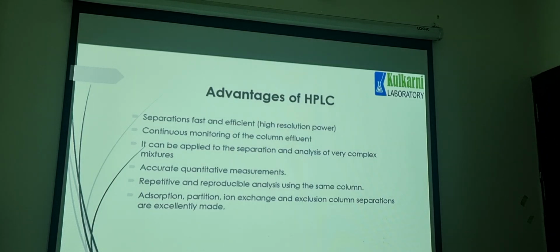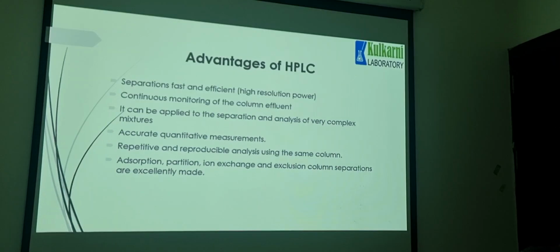That means it is repetitive and reproducible analysis on the same column. That means on a single column you can get a repetitive and reproducible analysis. How much time does it take to complete one sample?